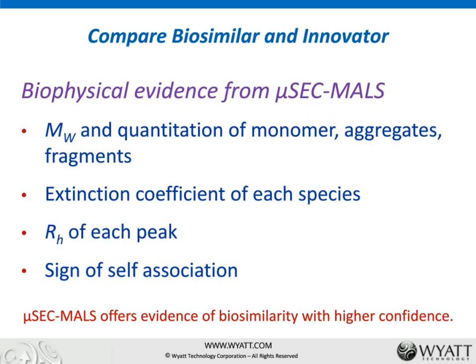So now let's see the evidence we can gain from µSEC-MALS for those biosimilars. We can measure the molecular weight. We can quantify the percentage of monomer, aggregates, and fragments. We can determine extinction coefficient and hydrodynamic radius of each peak. We can also detect signs of potential self-association. So µSEC-MALS can provide us evidence of biosimilarity with greater confidence.